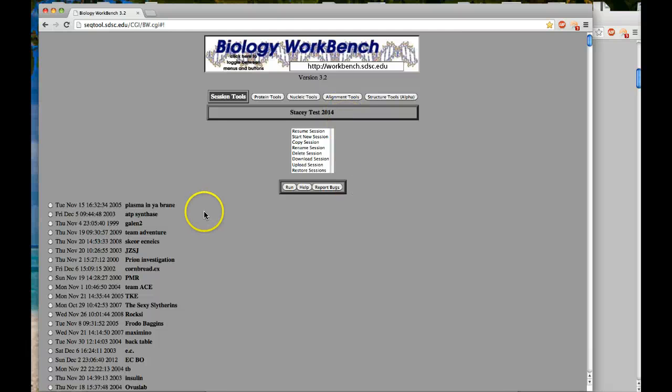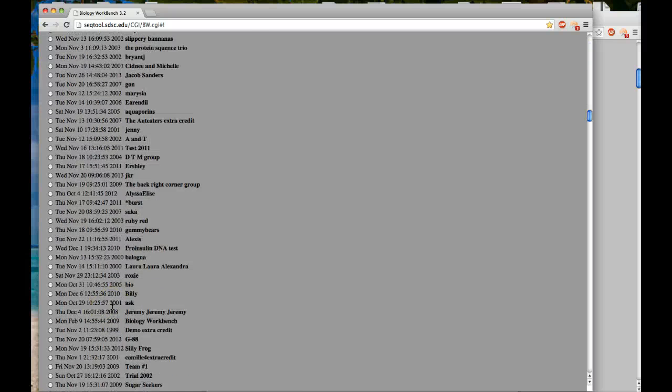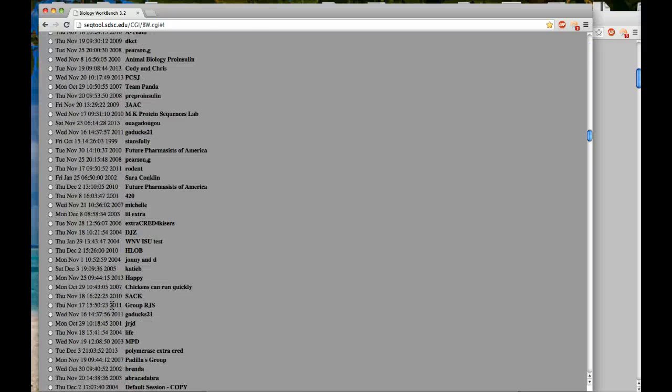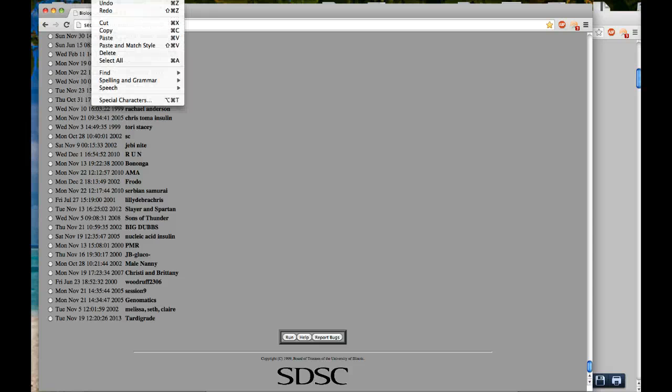Now say you stop, you come back, you want to join your session again, and look at this great big long awful list that you have to search through. What you can do, this is my secret for a lot of things in life, is in your browser, go to Find, and find on your page, or Command F, if you know the keyboards.